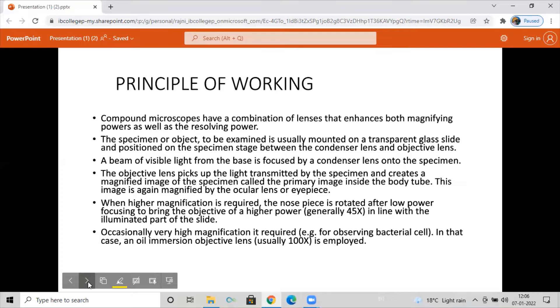When higher magnification is required, the nose piece is rotated after low power focusing to bring the objective of a high power, generally 45x, in line with the illuminated part of the slide. Occasionally very high magnification is required, for example for observing bacterial cell. In that case, an oil immersion objective lens, usually 100x, is employed.